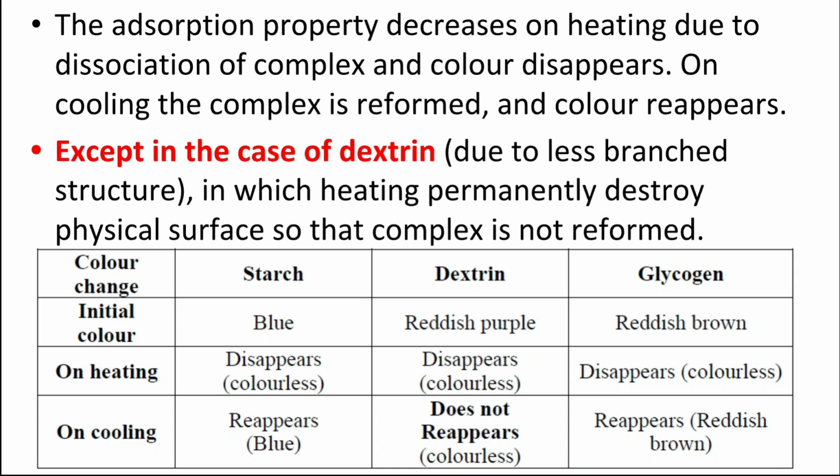Now, make sure you do not perform this particular practical or test in alkaline medium, as under alkaline medium conditions, iodine is not freely available. So it will not give any kind of positive results. Okay, so how to perform the practical? Actually, let's see.